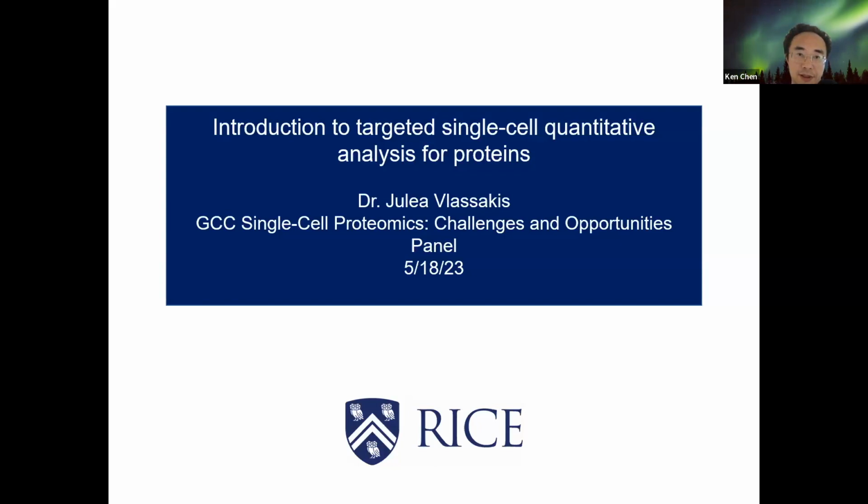And regarding proteomics, we've been analyzing, for example, CyTOF data and flow cytometry data on a fairly routine basis, and also increasingly into the spatial omics domain for the different platforms, for example, Codex, IMC, and other stuff. So I'm happy to be here to help answer some of the questions in terms of bioinformatics and methods.